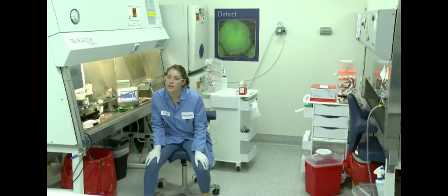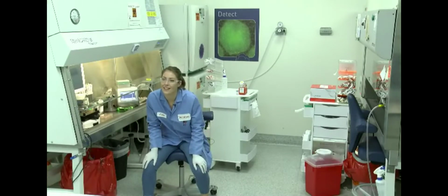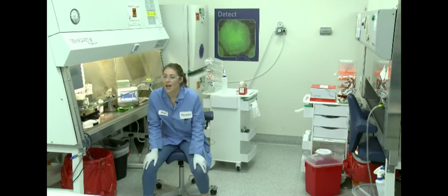So could you maybe elaborate a little bit more about the 24 conditions optimization, how you would go through that? Yeah, so like I mentioned earlier, the device comes preloaded with 24 optimized protocols which you can load onto the device and perform your electroporation. The difference in each protocol is the number of zaps you're delivering and the voltage that you're delivering, things like that. And you can go through all of them if you desire and see which one gives you the best transfection efficiency and best survival for your cell type.